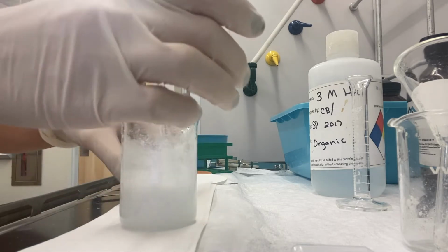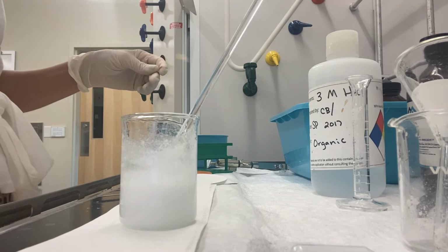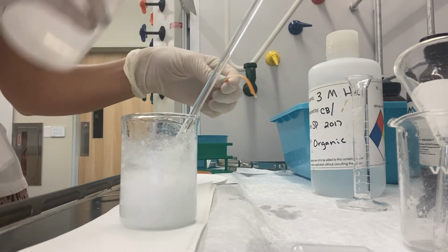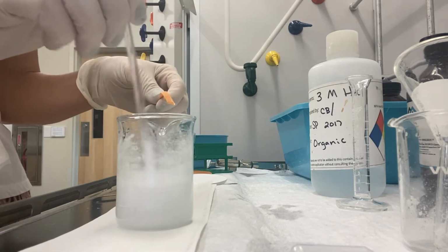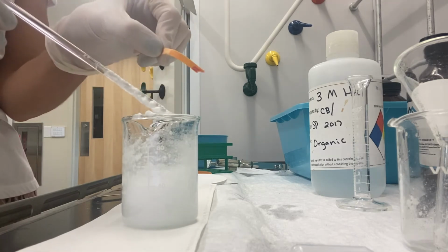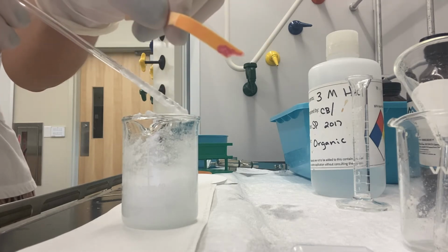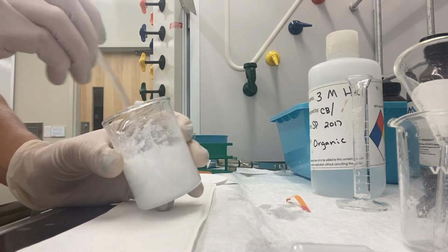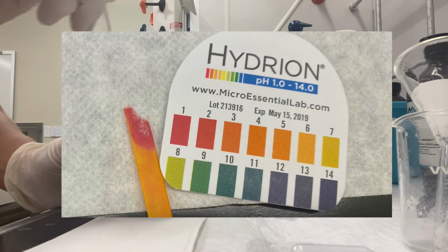So I've got my pH paper, and red is acidic, towards 1 and 2. So I'm going to pre-wet this pH paper before I test my solution. So if I just give it a little tap, you see that it turns bright red. Now you can look on the scale in your pH roll and see that that will lend itself to a pH of around 1 or 2. So we are good to go.